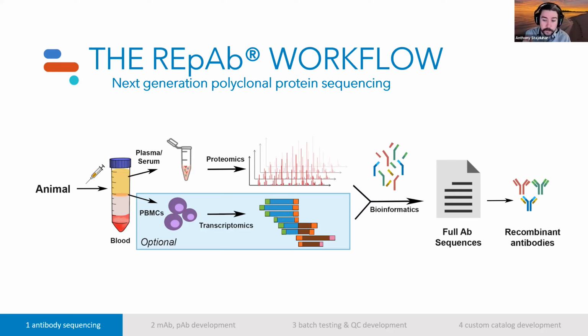So this is a really key component, I think, of working with us in this kind of workflow, is ensuring that the antibodies that are in the tube are the ones you want. I have no doubt. I have absolute faith in our ability to sequence the antibodies inside of a tube. It is always about ensuring that the antibodies you want are the ones that are inside of that tube. So that's always, I'm a stickler about that. I just want to make sure that we're always on the same page whenever we discuss this. So once we have this purified polyclonal antibody pool, very similar to what I was mentioning above, the antibodies will be put through our sample preparation chemistries.